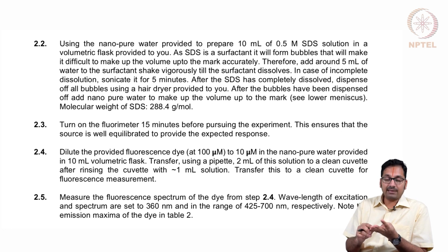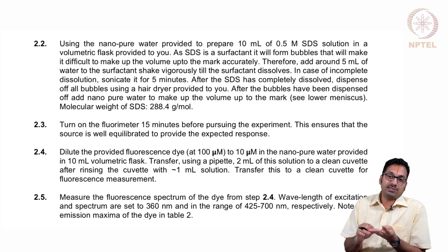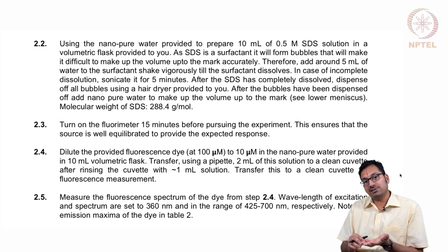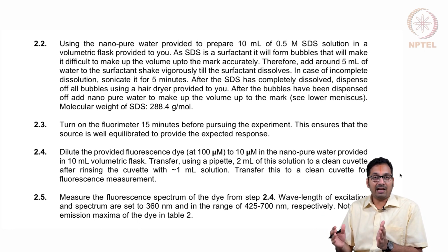It could come from the fact that when you are adding a certain amount of SDS to the solution, you have not equilibrated it enough such that the fluorescent intensity does not reach the equilibrium state that you might want to get. And it could also be the case that you might not have set up your excitation wavelength and emission spectra, the wavelength between which you want to record your spectra. So all this has to be carefully done.